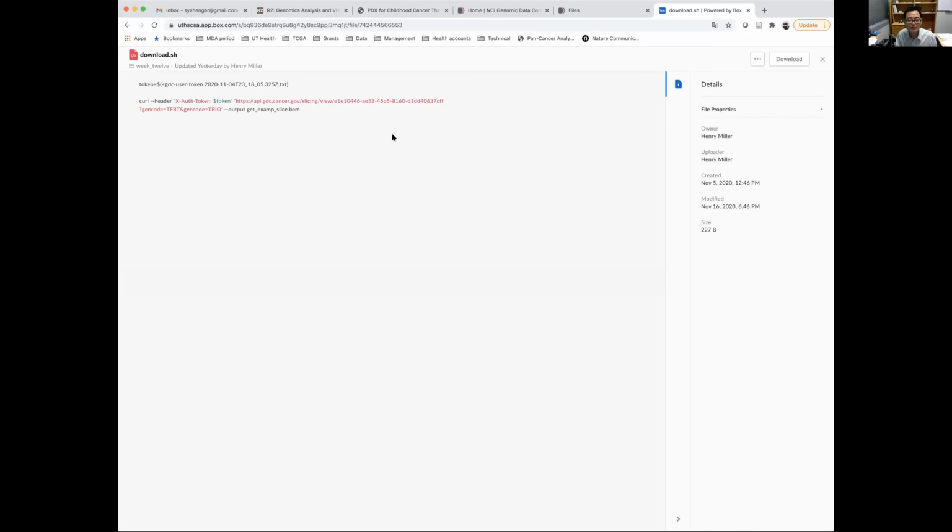I was very much baffled, so I went back to STAR. All these use STAR for the alignment. Now I think I realized that unless you tell STAR specifically to write these reads into the BAM, it won't write the fusion reads into the BAM. It writes the fusion reads into a junction file, and the information is included there. So that's the reason, even when I download these BAMs, I won't be able to see any fusion reads in my BAMs.